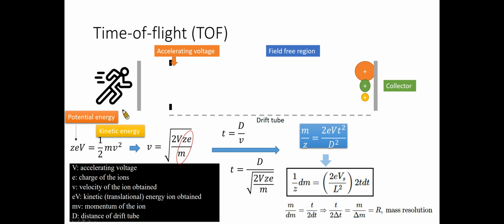The following calculation describes the TOF analyzer dynamics. The time it takes for the ions to move across the flight tube between the ion source and detector allows us to determine the mass-to-charge ratios. In a TOF spectrum, the recorded peak for any mass-to-charge ratio will correspond to the sum of signals corresponding to multiple and independent ions arriving at the mass detector.